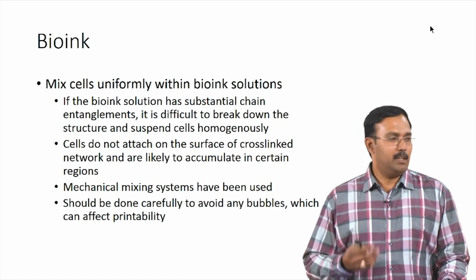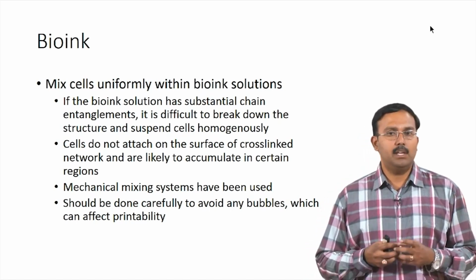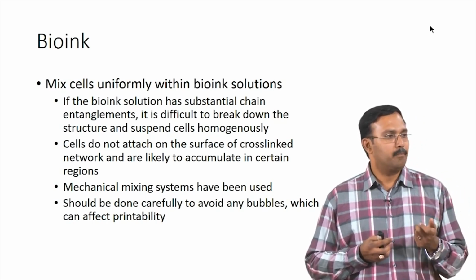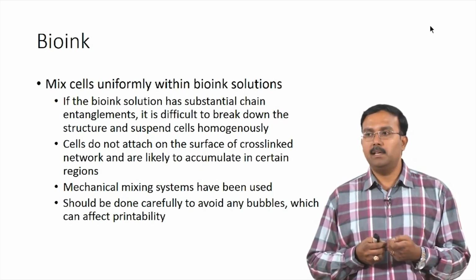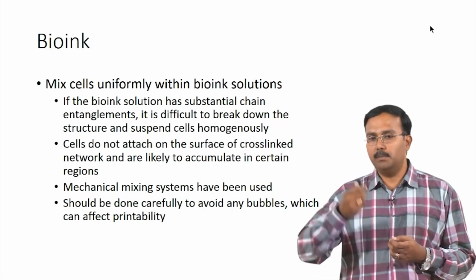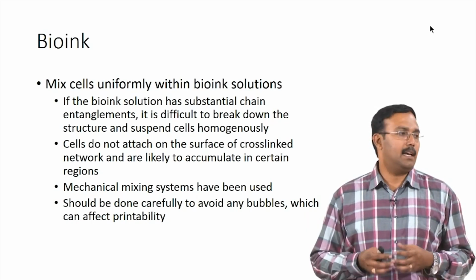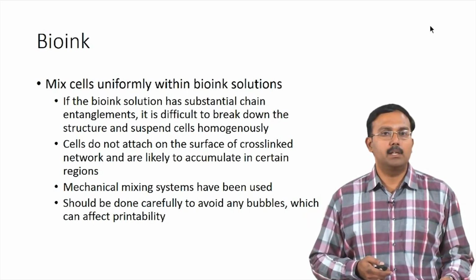In addition, it should also be done very carefully so that you don't have any bubbles. If you have bubbles, it affects the printability. While the ink is being printed, you should not have any bubbles. It should be a uniform flow of the ink. So, these are things which need to be taken care of while you are preparing a bio ink.